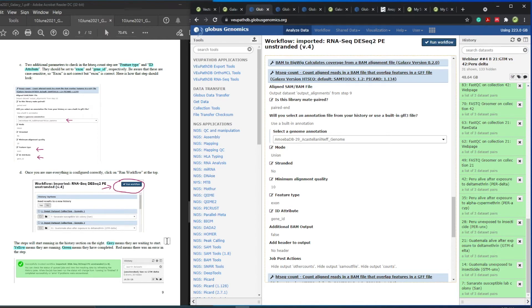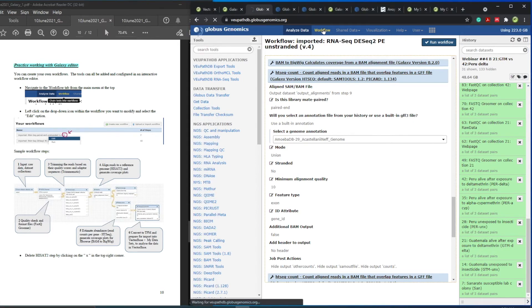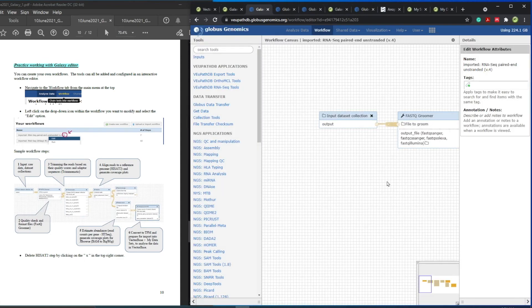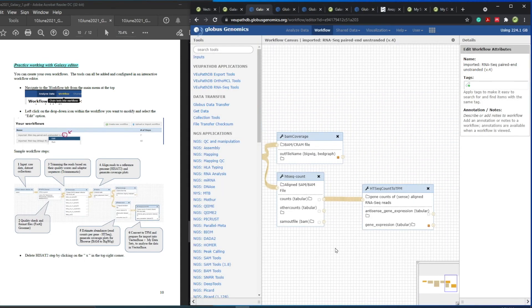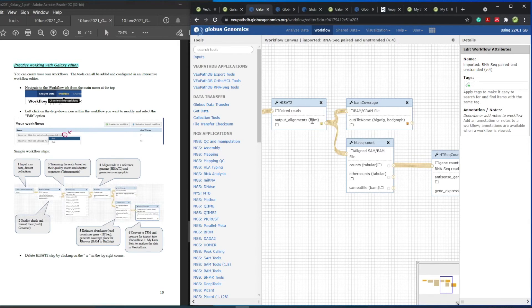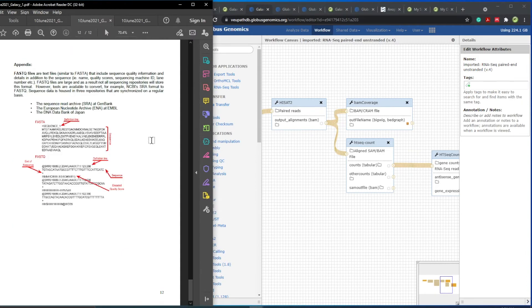Once you click Run Workflow, you get a screen in green telling you that everything worked fine. In the workflow editor, you can select any of our workflows and import them to your own workspace, edit them, connect and disconnect steps, and learn how the output from one program becomes the input to another. The appendix in the handout is a refresher of what Katrin already told you about the structure of the pipeline.